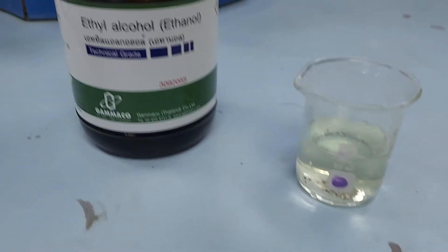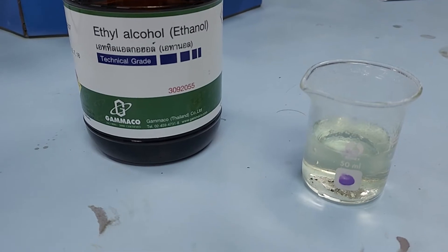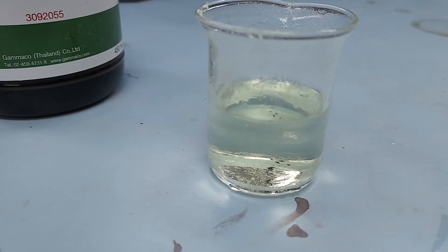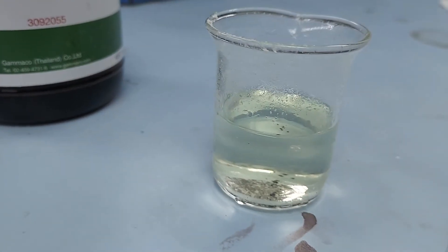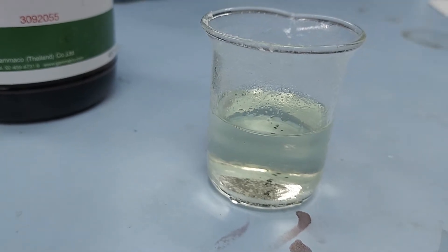For stage two of the experiment, our solid is recrystallized using warm ethanol until it's all dissolved. Now we're going to crystallize it out by cooling it down and placing it in ice cold water.